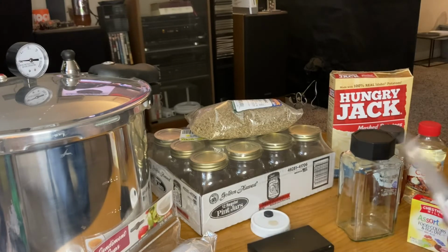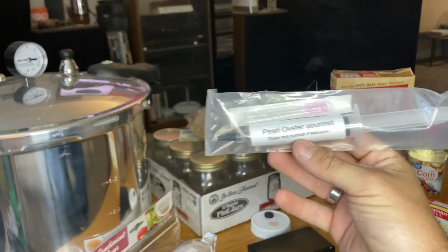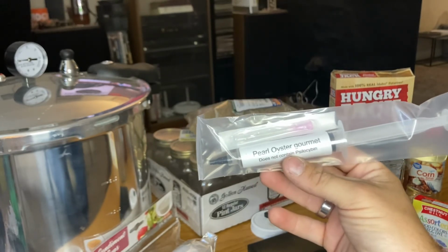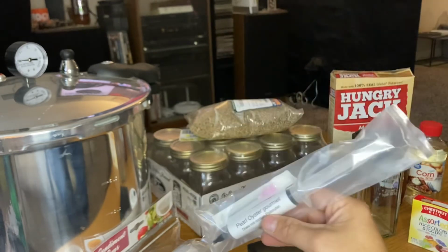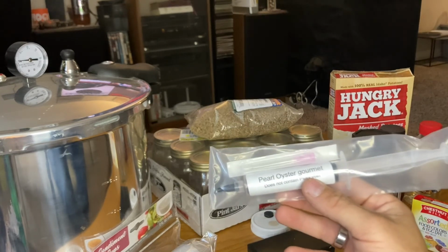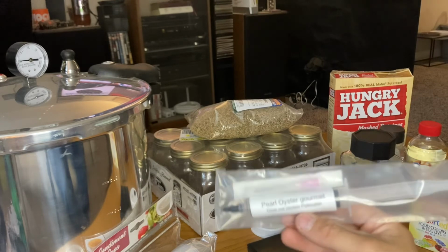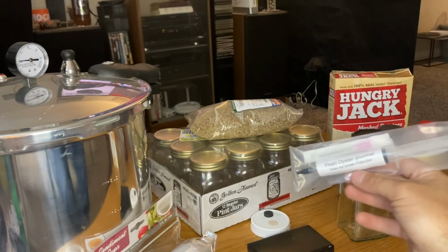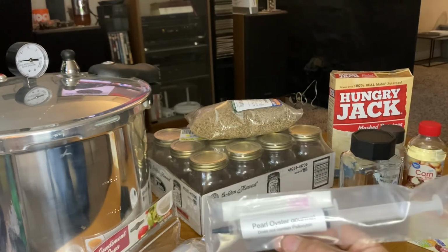From there, you're going to want whatever kind of spores you want to use. These are Pearl Oyster Gourmet. And I'm going to actually be going through the process of putting these to agar with you guys, and then letting the agar grow. From there, I'm going to make a liquid culture out of it. And then from there, I'm going to make a rye berry jar, and I'm going to inoculate the rye berry jar with the liquid culture made from this spore syringe.